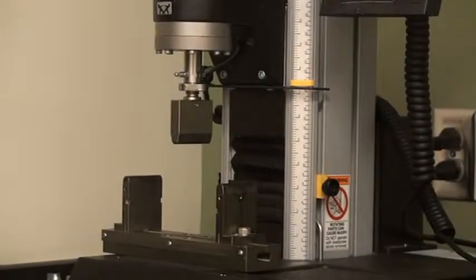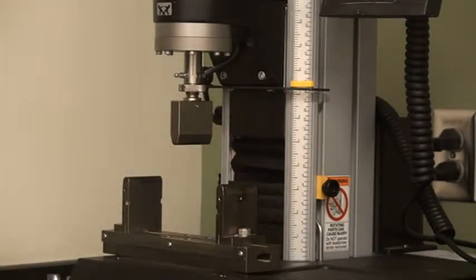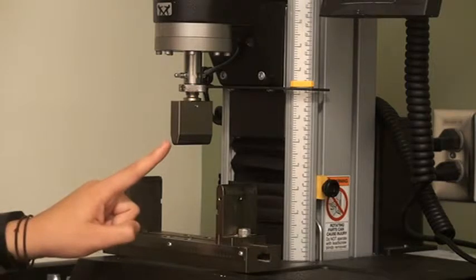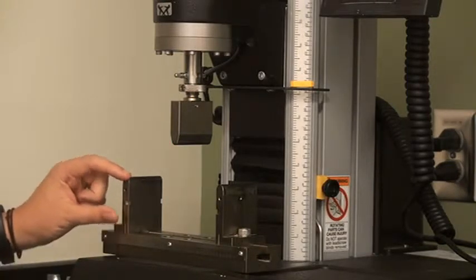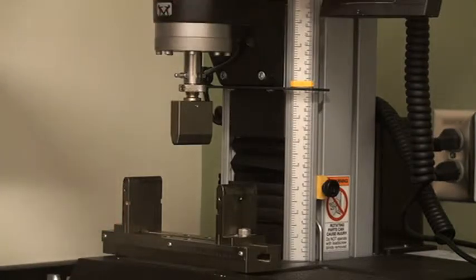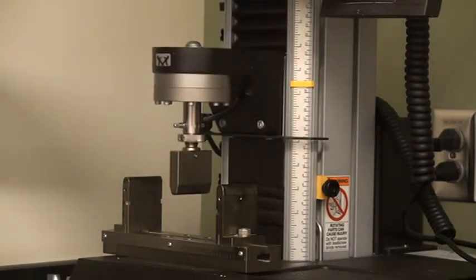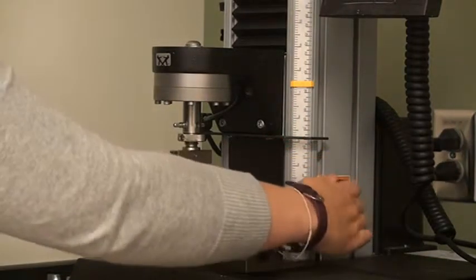Before testing, make sure you set your safety stops. The lower one should be set so that it prevents the assemblies from making contact with one another. Slowly jog the actuator down until the tip of the upper anvil is about halfway between the tips of the lower anvils and the base plate. Move the safety stop up so that it will trip at this point.